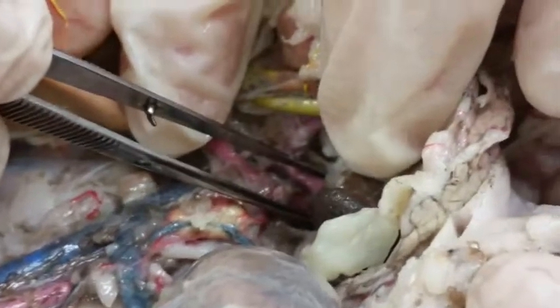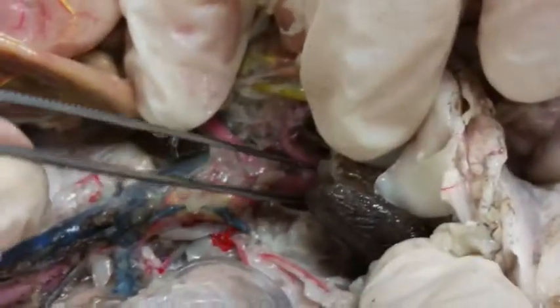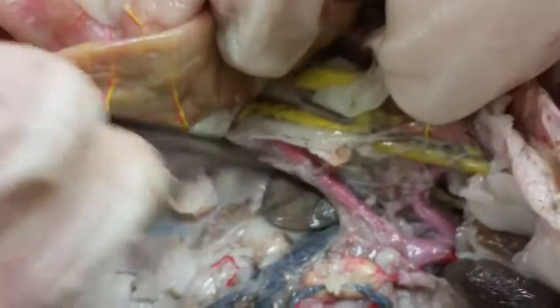we have the, kind of difficult to see, but right along through here we have the celiac artery, which eventually branches. You can see the dorsal aorta, which runs underneath it all. So we've got aorta over here, branches, we have the celiac, and then we also have the cranial mesenteric, which helps feed the mesentery, so you can tell because that kind of is pointing down into the mesentery here, whereas the celiac is eventually going to kind of lead up into the stomach region.